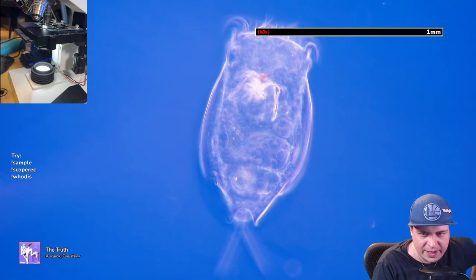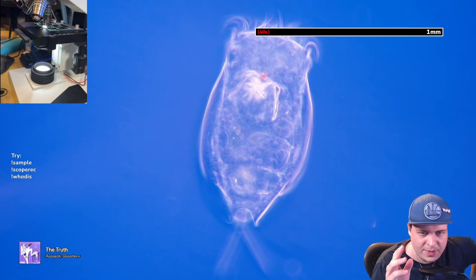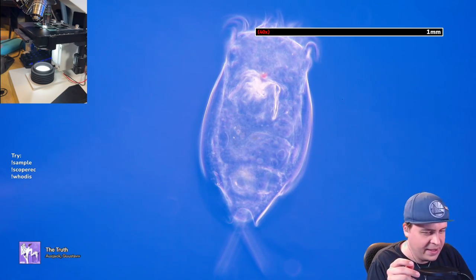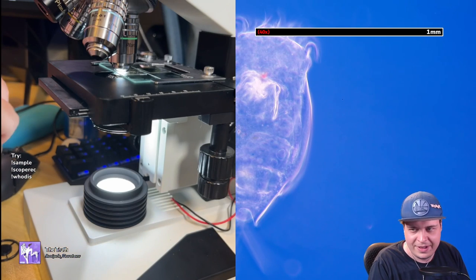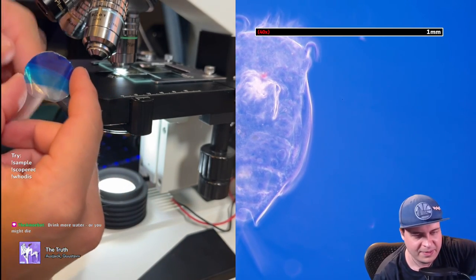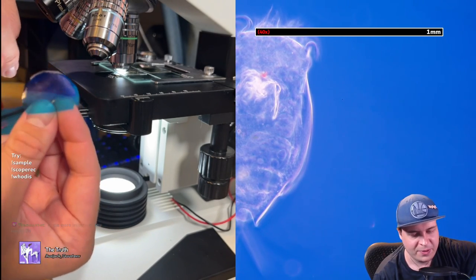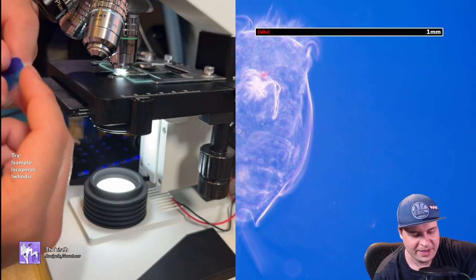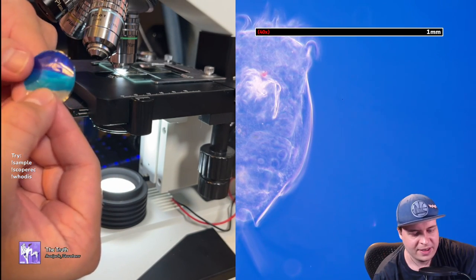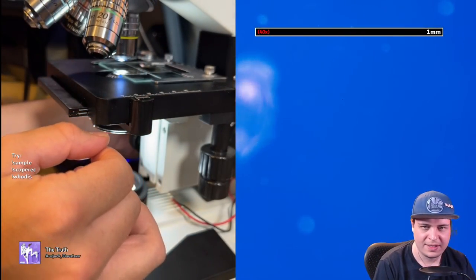One side of the light is going to be dark and the other side is going to be light. There are a ton of ways to do that, each with certain drawbacks and positives. I want to introduce the second Aquafina-based filter we're going to show today. This is actually two pieces of the label — the label has a section on the sides where different shades of blue overlap, so if you stack them you get a brightness gradient filter from dark on one end to clear on the other. I'm going back to 10x to get focused.